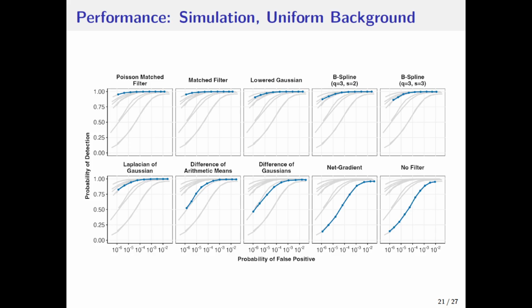Okay, thank you. By the way, why should we use the net gradient filter, which is almost the same as no filter? You shouldn't. Easy answer. Because even in some images it seems the same or even worse in one of the images, which is weird. The net gradient filter is used in Picasso, which is popular in DNA-PAINT. I've even talked to the guy developing the software, and he said, "Yes, we know about it. We would like to implement it, but you know, doing a PhD and developing software is not easy. For software, you don't get much."